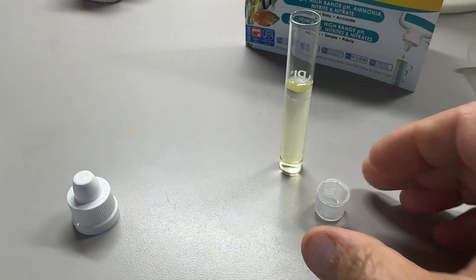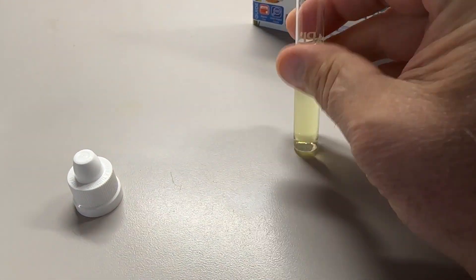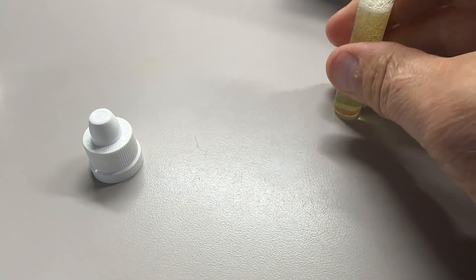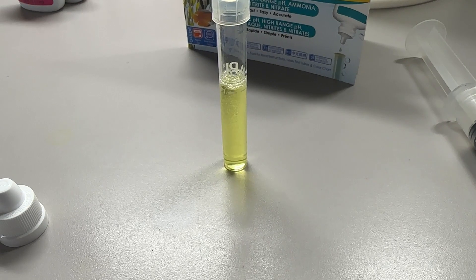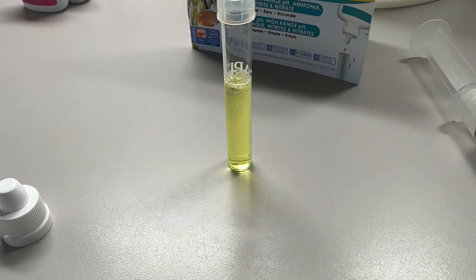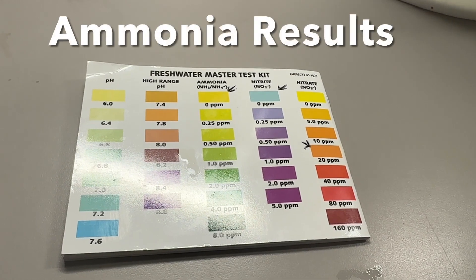Now cap the tube and shake it for five seconds: one, two, three, four, five. Then we're going to wait five minutes, so set your alarm. Hey Siri, set alarm for five minutes. We'll be back.